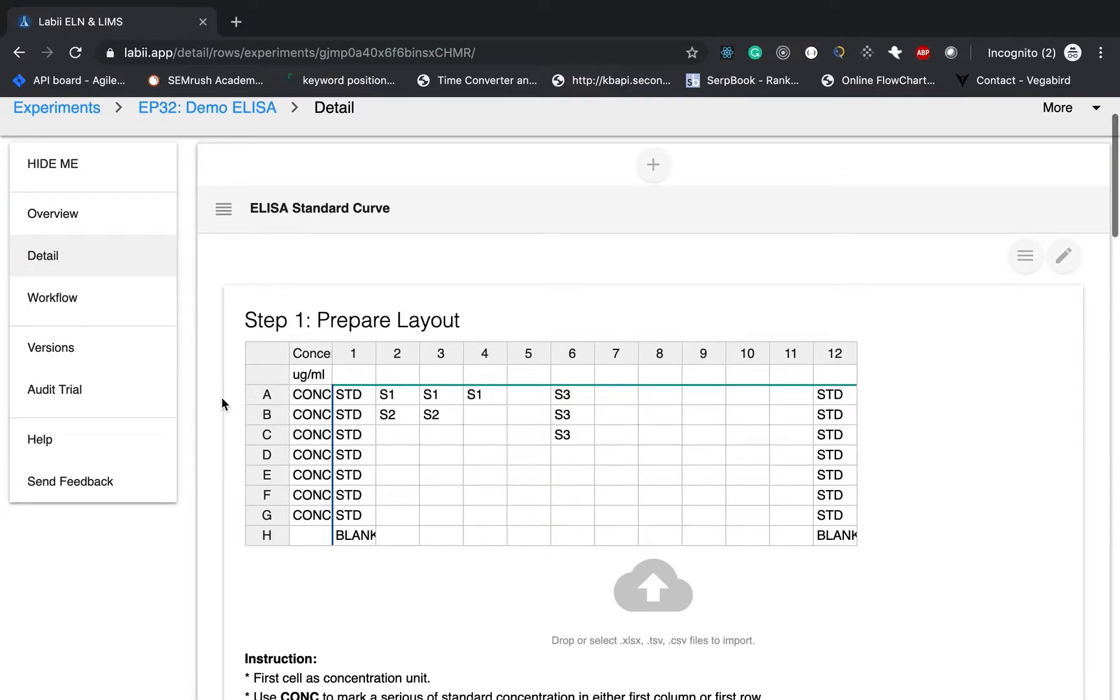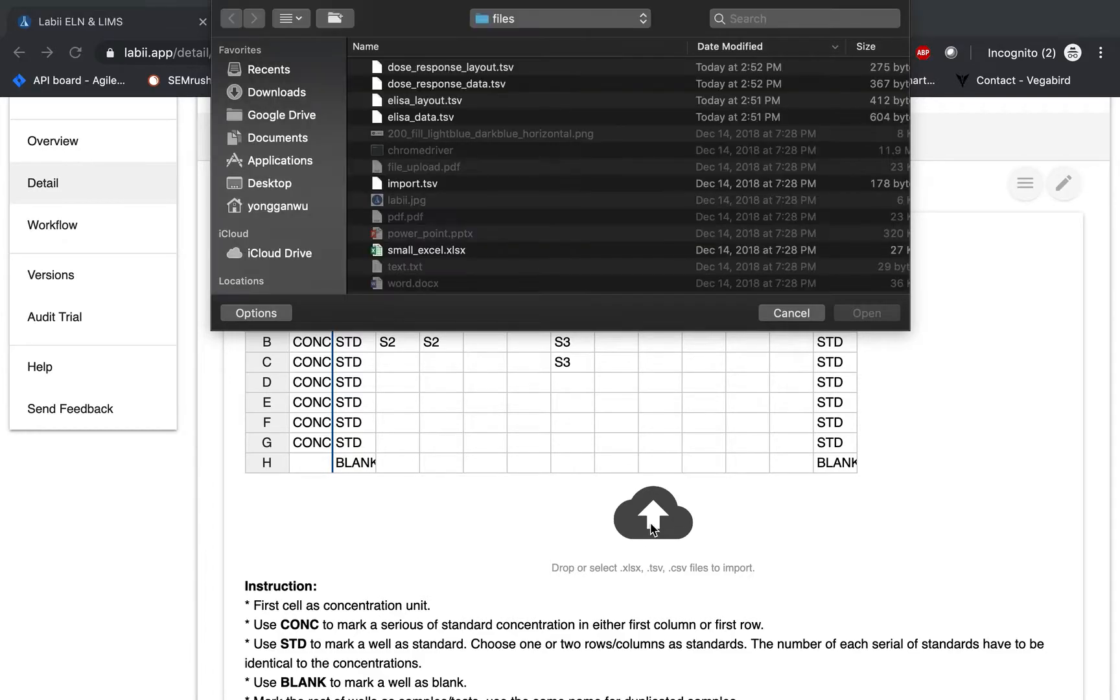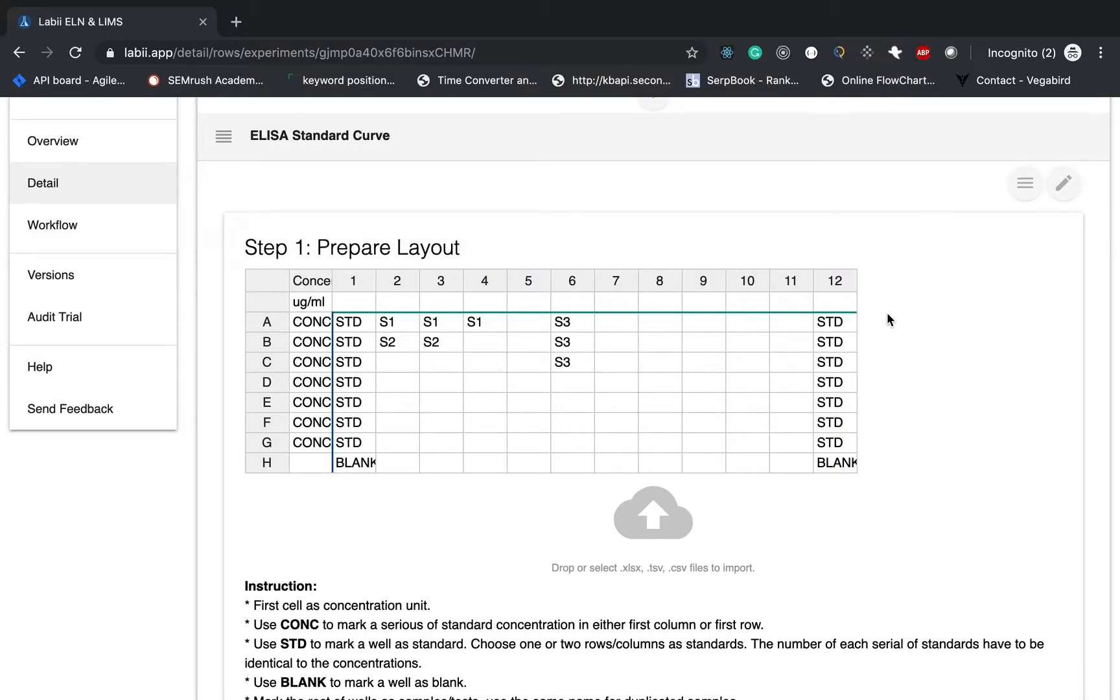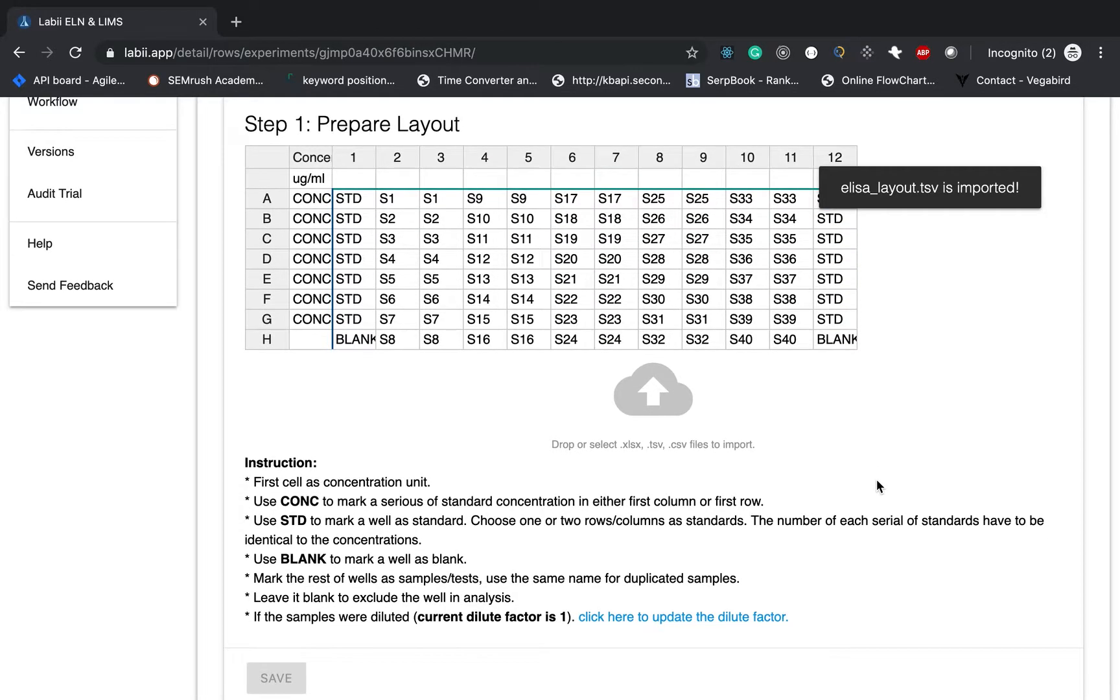Then it's coming back to the layout. If you already have a file, just simply click this icon or drop the files into this icon. And then I will choose in the ELISA layout. Then all the data will be imported automatically. And then it also being saved.